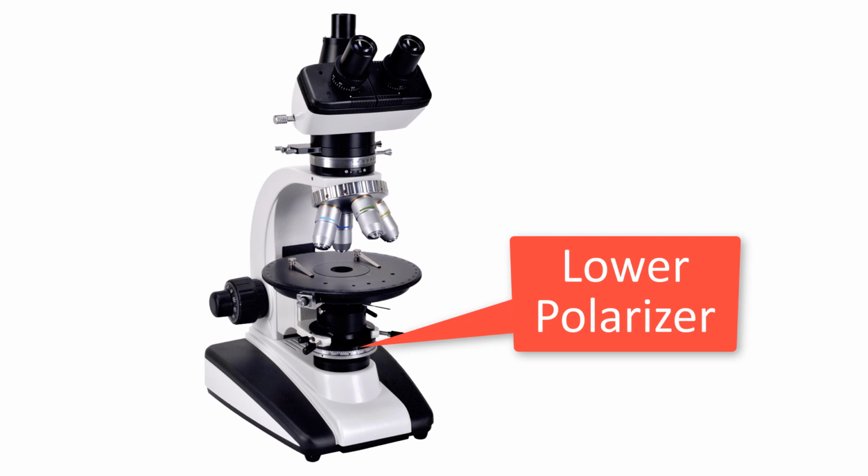Thus, the light becomes plane polarized. The plane polarized light then passes through the microscope's stage and the thin section. Observing minerals in plane polarized light enables us to observe opaque and non-opaque minerals, crystal shape, cleavage, color, and relief.